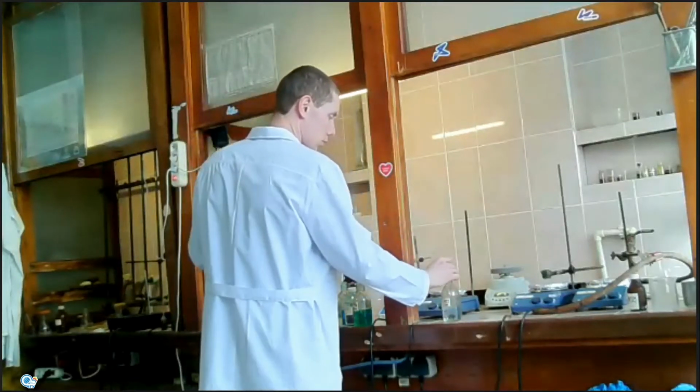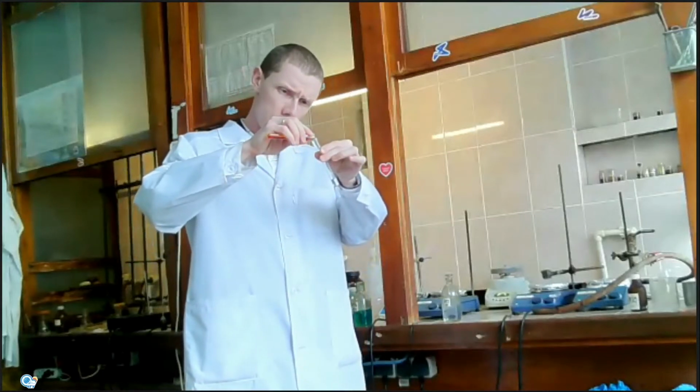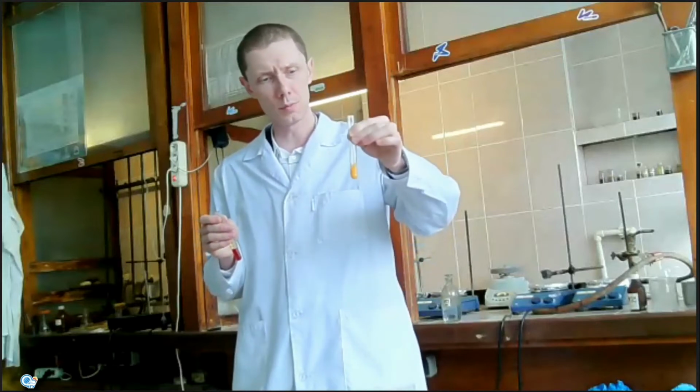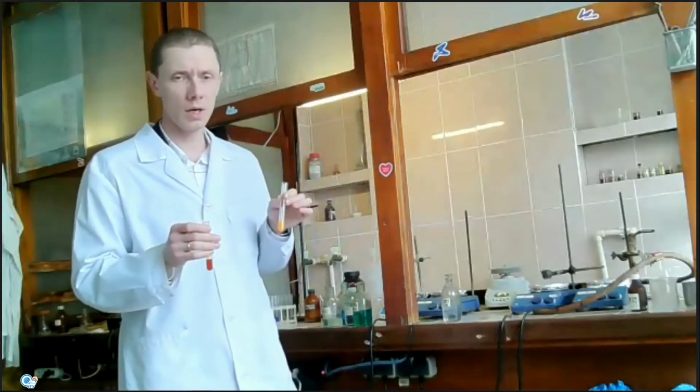But if I take the sodium hexanitrocobaltate solution, we prepared this solution before the experiment, and mix them, we can obtain yellow color precipitate. It's because the salts of hexanitrocobaltate with potassium and sodium are insoluble in water, and this reaction can be used to determine the potassium ions in aqueous solutions.